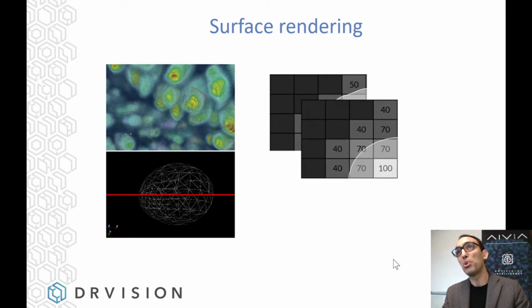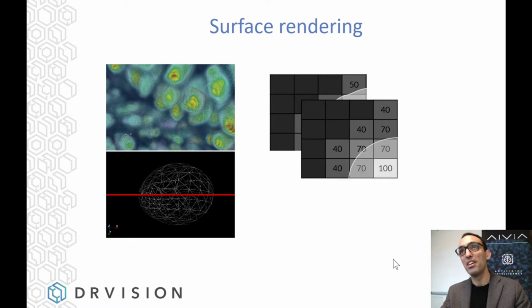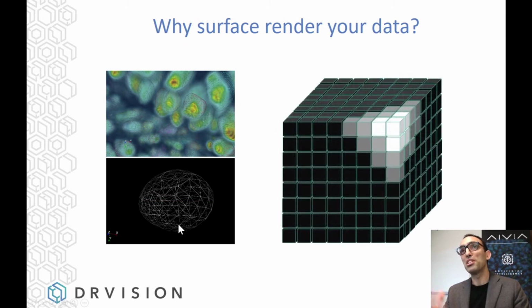If we then look at multiple optical sections, so I'm going up in Z or down in Z, either way, what happens is the intensities will drop away, of course, because you're moving up this way or down this way, so fewer voxels will have the bright intensity because it's a smaller cross-section. And if you build a 3D block, it will look something like this.